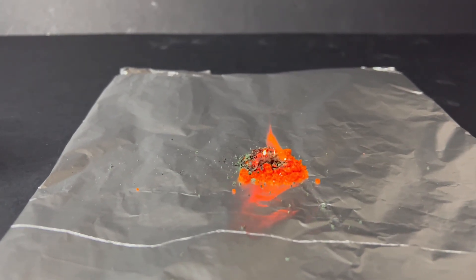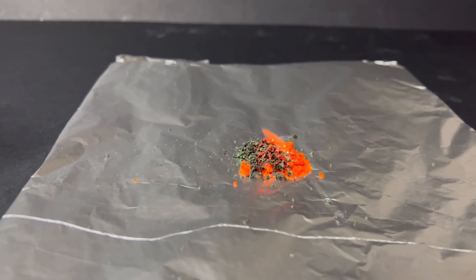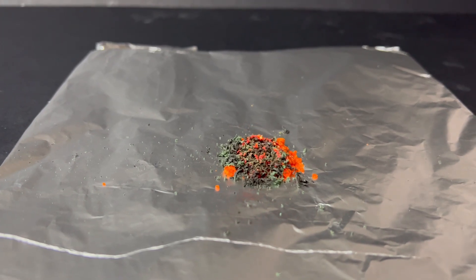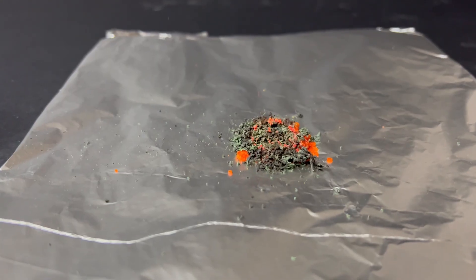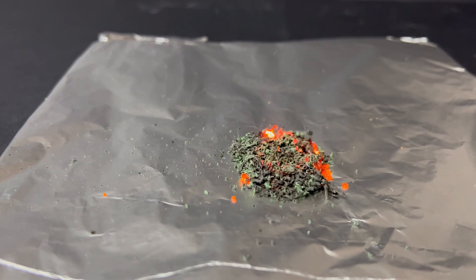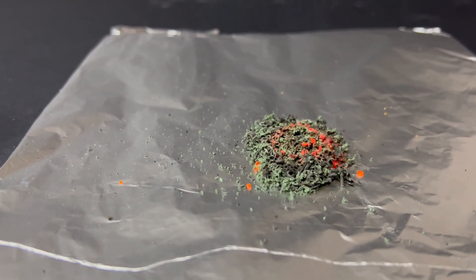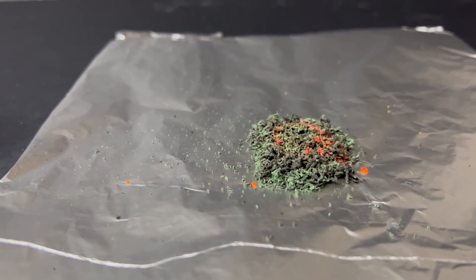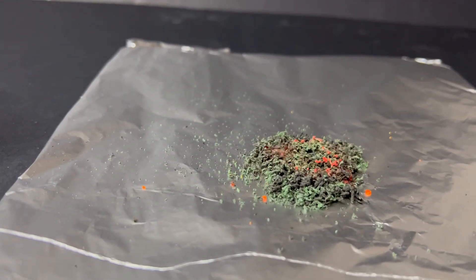As the reaction proceeds, you can see the bright orange crystals start to glow and give off sparks. The orange colour slowly changes to a dark greenish black substance. This happens because the ammonium dichromate decomposes when heated. It breaks down to form chromium oxide, which is green, along with nitrogen gas and water vapour. The change in colour shows that a new substance has been formed. The glowing and sparks are a result of the heat and energy released. This is an exothermic reaction.